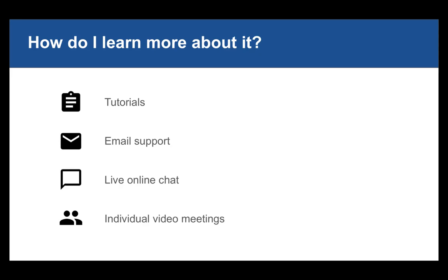And finally, since the demonstration today isn't going to get down into all of the details, if any individual groups are interested in learning more, then we would be more than happy to set up some individual meetings with those labs where we can go into a little bit more detail about how the tool works and maybe discuss particular use cases that they may be interested in pursuing.